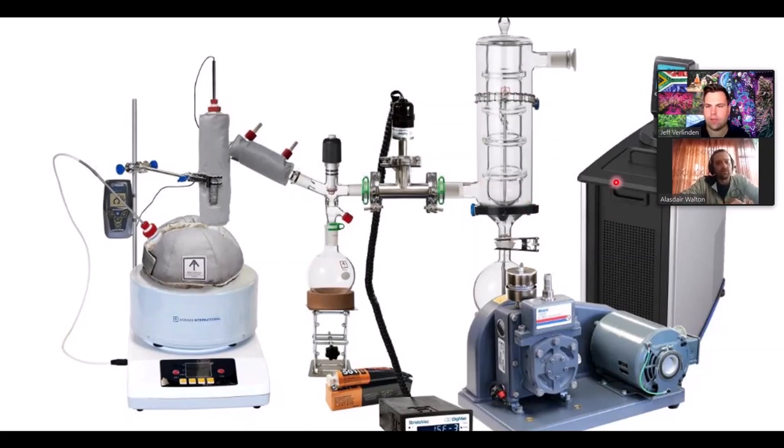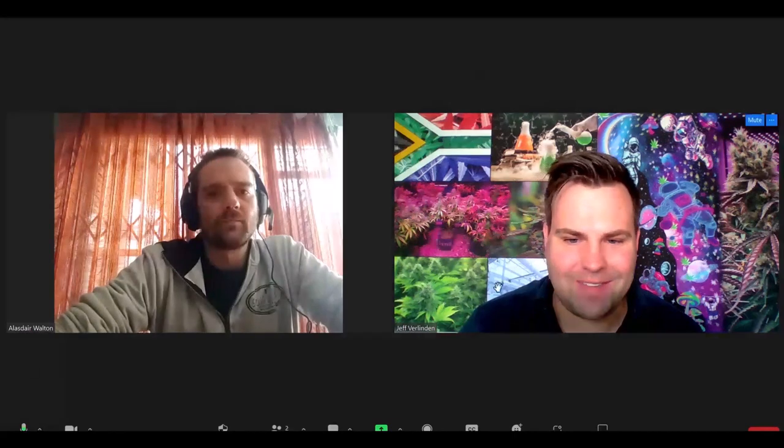Awesome. And for those who don't know, this is an example of a chiller. Precision chillers are obviously your Lauda, your Huber, and your PolyScience type of chillers. And then you've got Edwards pumps as well. Generally, there's a range of some good pumps out there. And on that question, I'm going to stop sharing because I always like it back in the full screen.